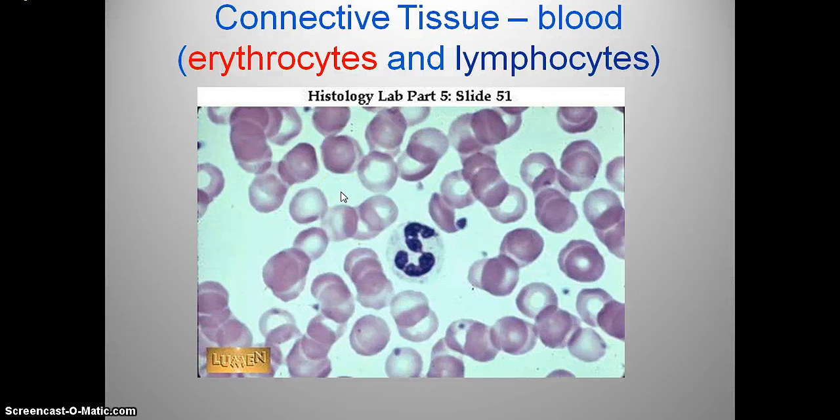If you can imagine a bowl, that's the shape of a cell. It's very helpful for flow of the cells through the vessels. In the center of this bowl, we have hemoglobin, which is binding to oxygen as well as carbon dioxide and carries it in and out of the cells.